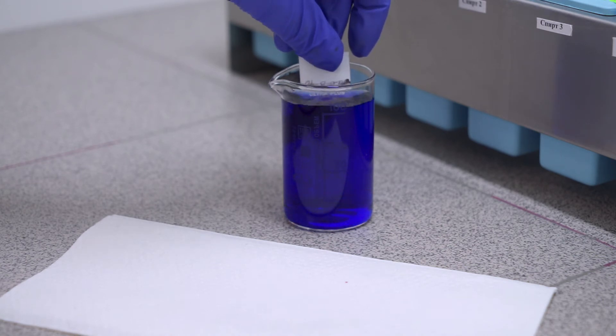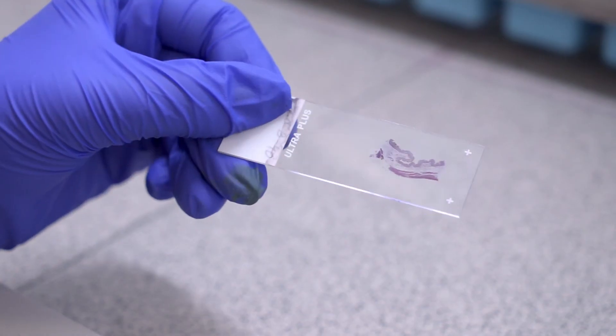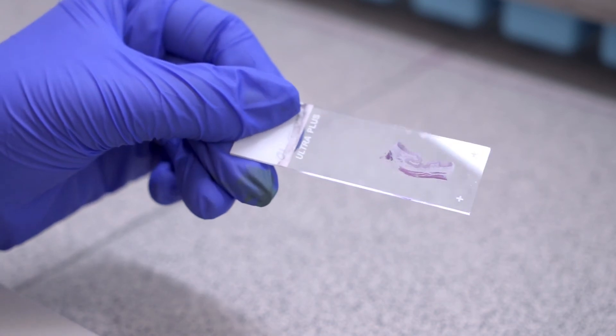As a result, nuclei are stained in black color, cytoplasm and muscles are red, collagen is blue, and erythrocytes are yellow.